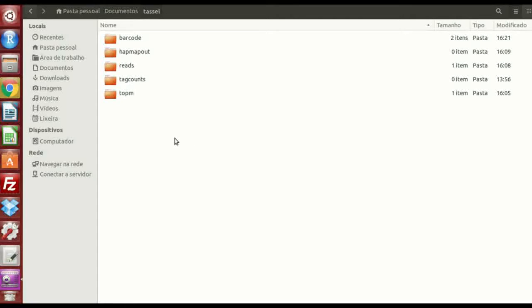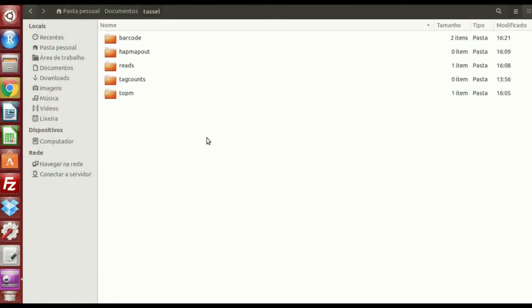I have some data from GBS, the genotype by sequencing, and I want to make this raw data that are in FASTQ files and make them become SNPs that we can use in mapping, GWAS, and things like this.